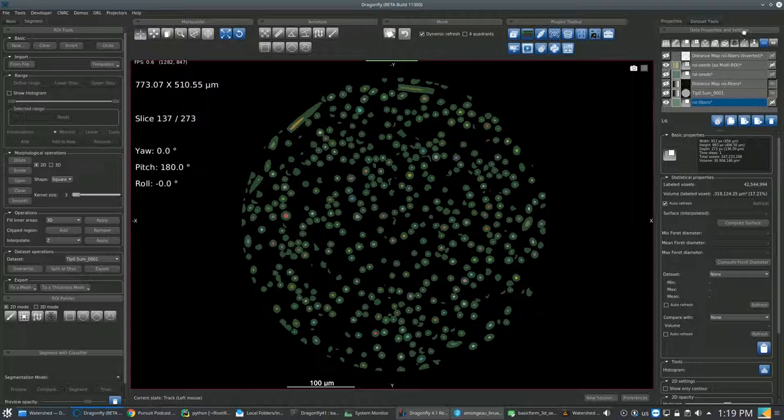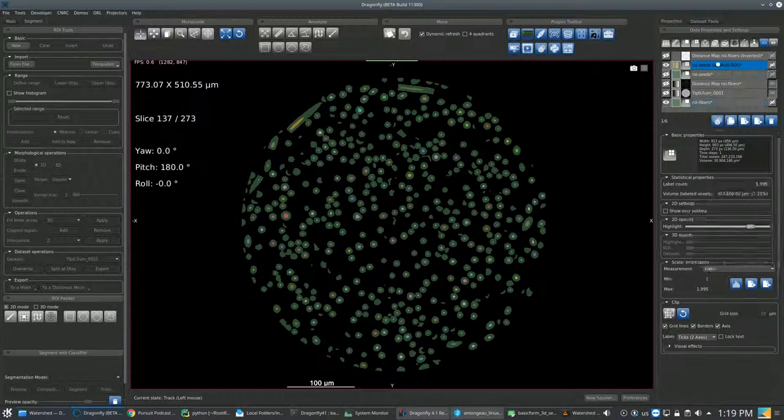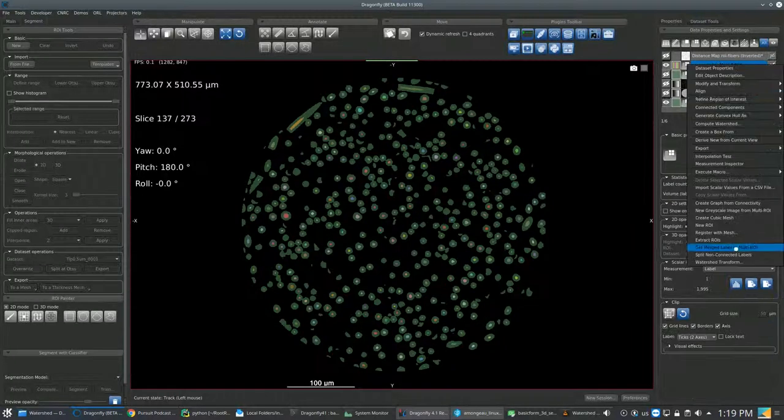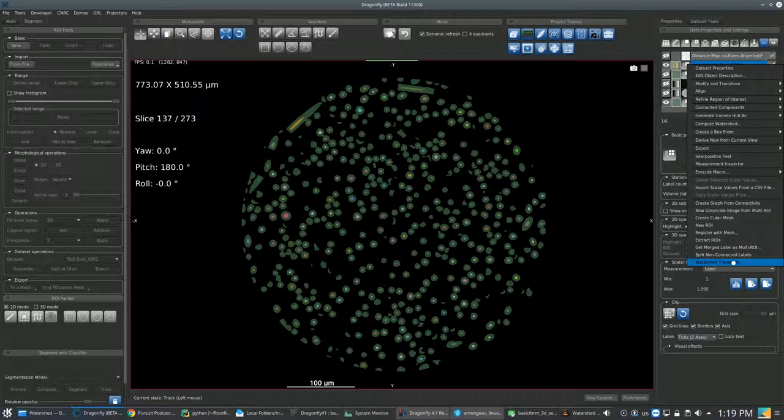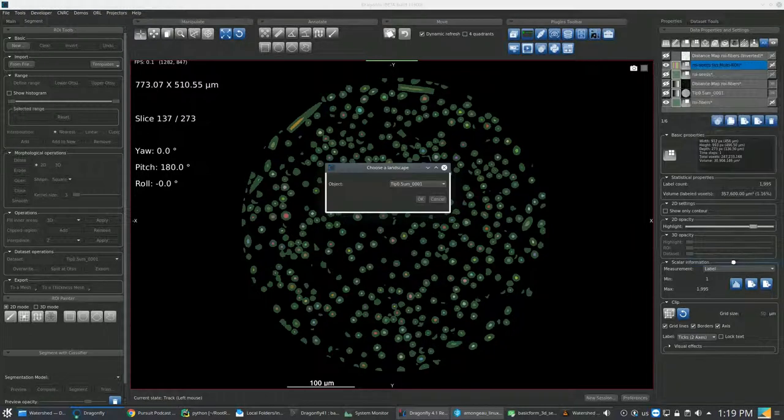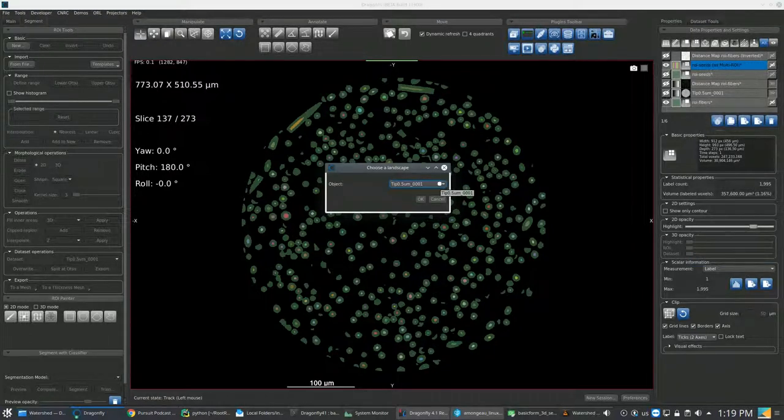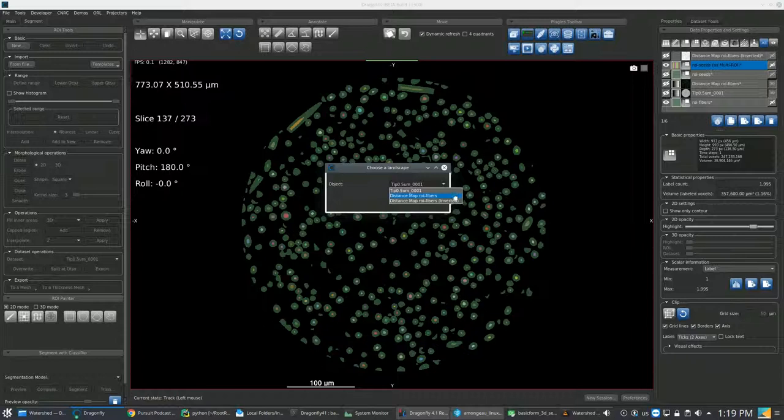Then go back to the Multi ROI. Right-click and then select the Watershed Transform button.